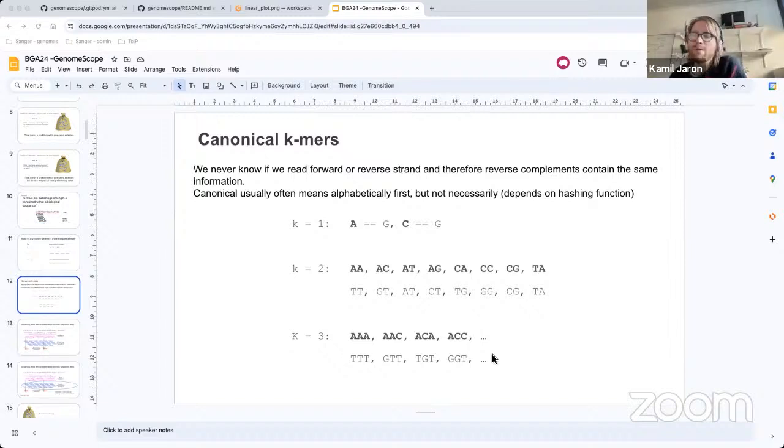And actually, for lots of applications, it would not really matter. It's almost like a convention thing. Like I would say we just all agree that let's just all do just odd k-mers, just because for some applications it makes a huge difference.